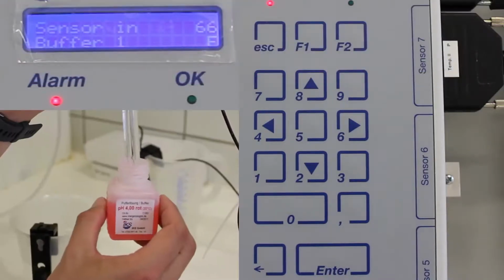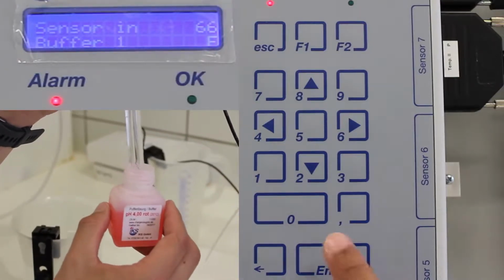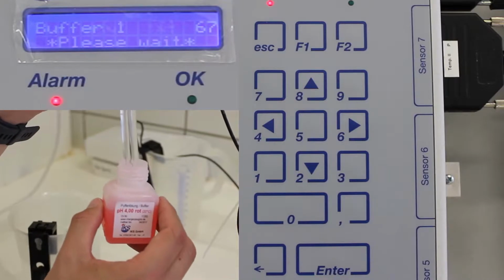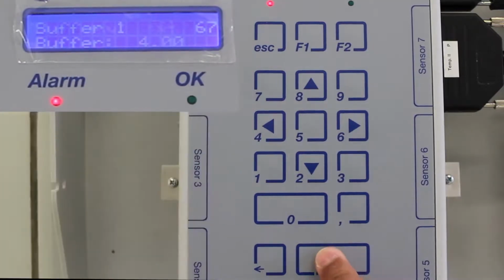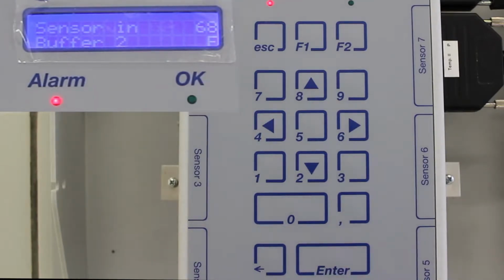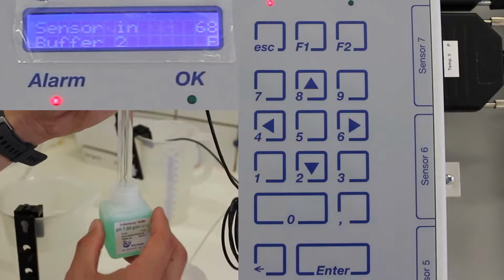Put the pH sensor into the buffer solution labeled 4 and then press Enter. Wait until the value 4 appears in the display. Then press Enter. Remove the sensor from the buffer, rinse it with distilled water, and dry it with a tissue paper. Place the sensor into the buffer solution labeled 7.